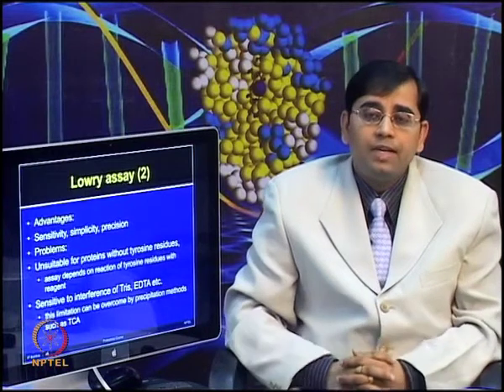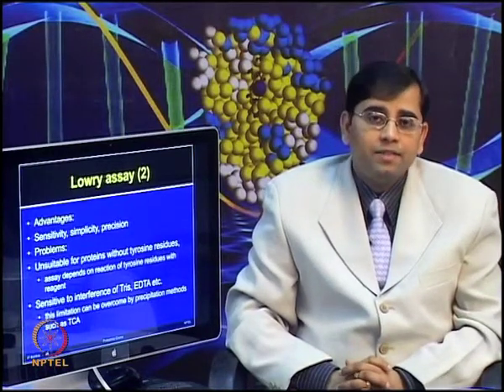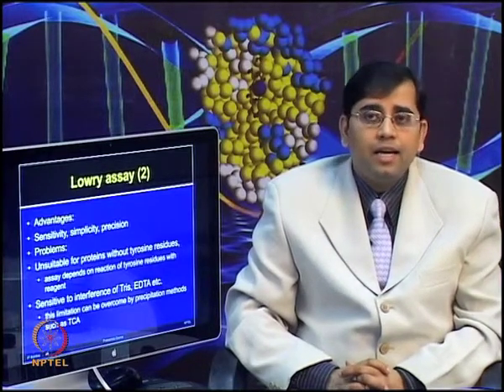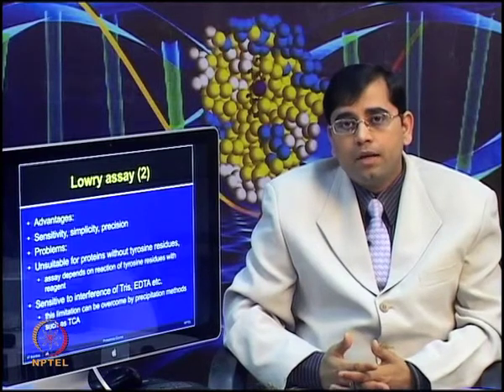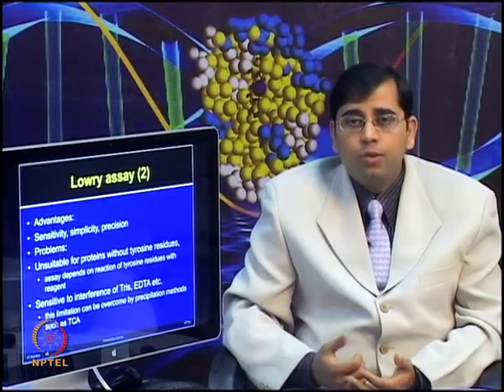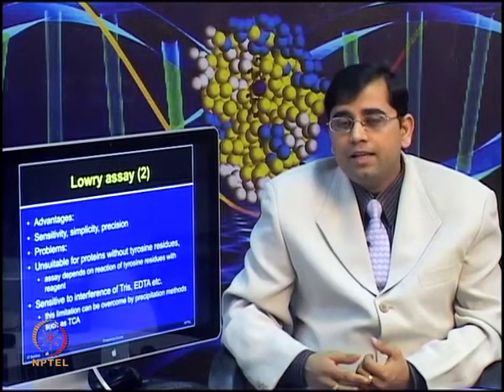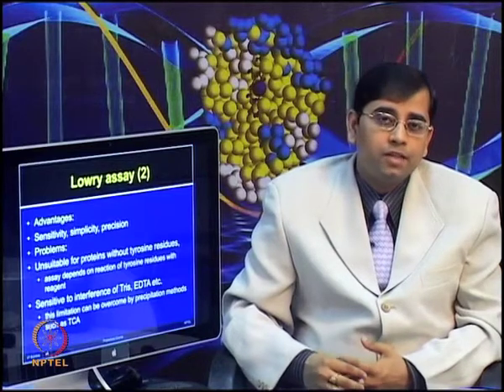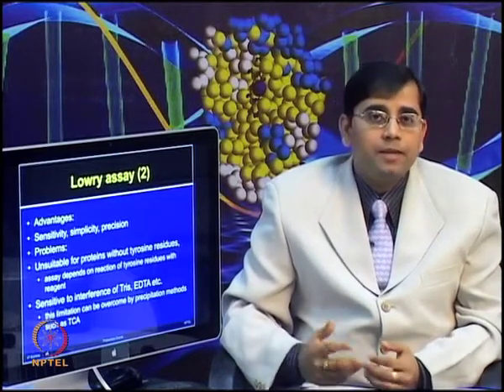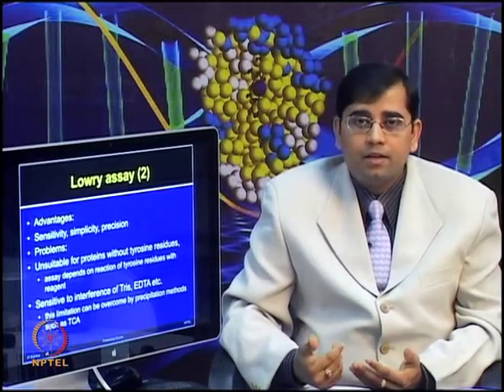This method is very simple, it is very precise and it is very sensitive. These are various advantages of using the Lowry assay, and that is why when people have abundant enough proteins in their samples, they have conventionally used the Lowry method. But if you are using clinical samples or samples with very low yield, this may not be the best method to use, and that is why different other methods are also available.